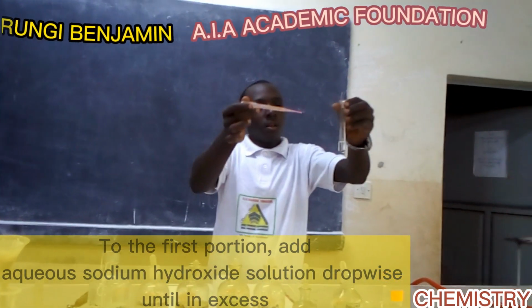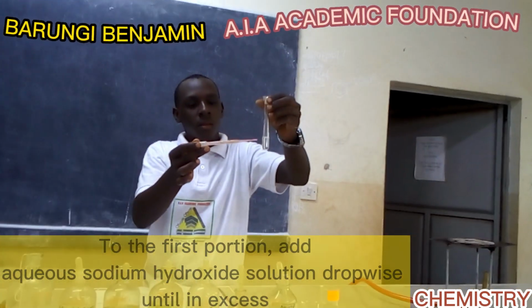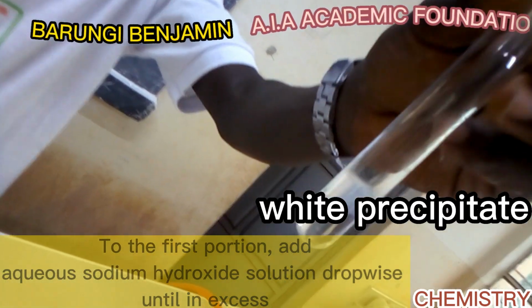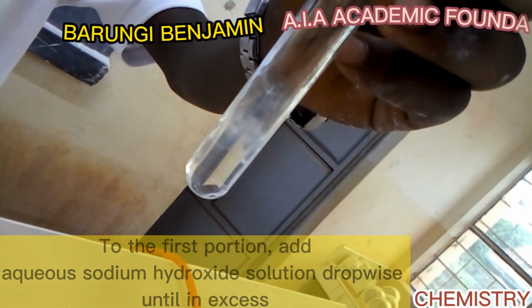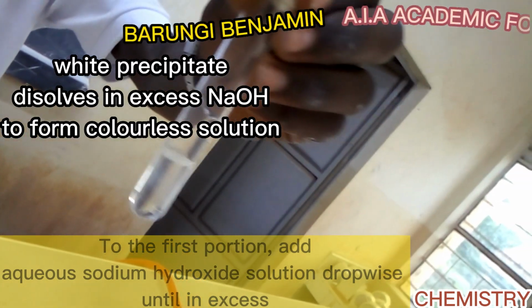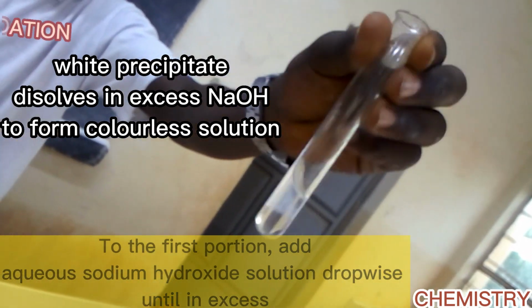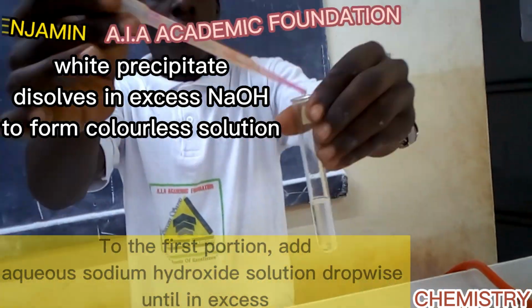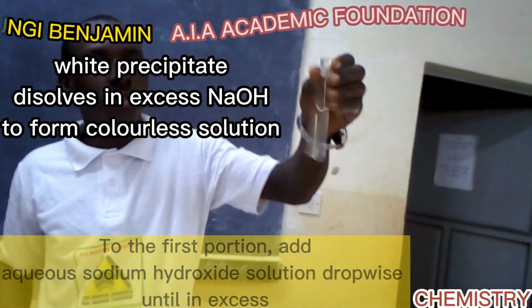You can see as we are dropping, we are seeing some white precipitates. Those are the white precipitates that we are obtaining. But these white precipitates disappear with time. When you drop, the white precipitates are there, but with excess we have obtained a clear solution.